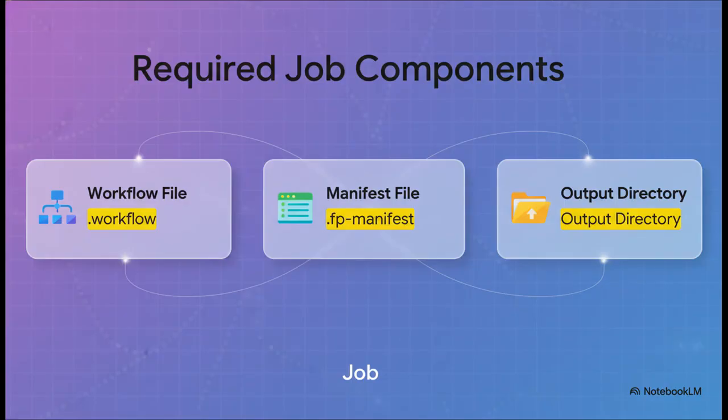And making a job is super easy. You only need 3 things: your saved workflow file, a manifest file that lists all your data, and a folder where you want the results to end up. That's it.